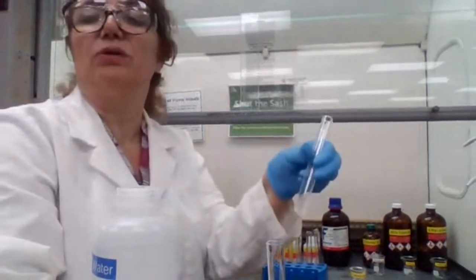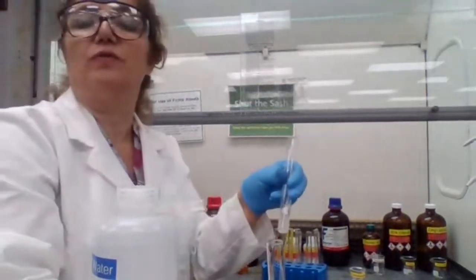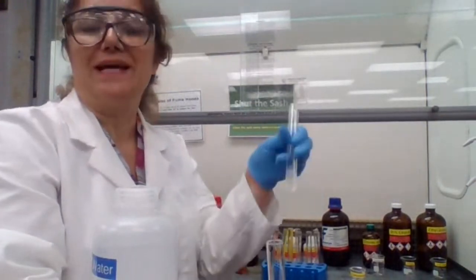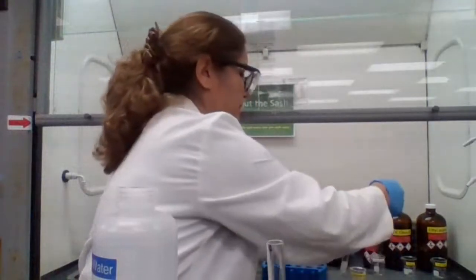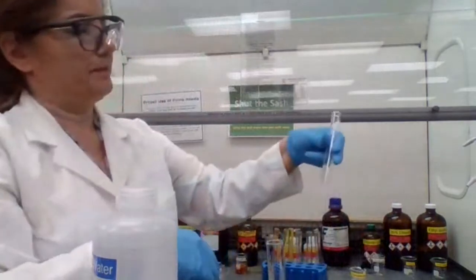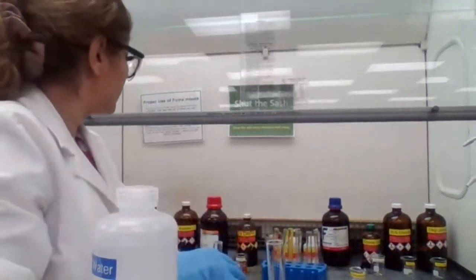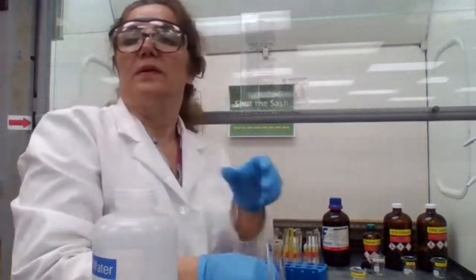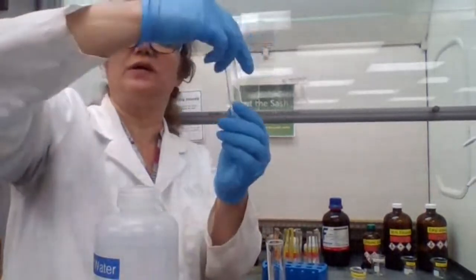We're adding the 1,2-dimethoxyethane to dissolve it, to make sure that it's dissolved. Okay. And when it's dissolved, what's next? Okay, it's dissolved. It dissolved already. What should I do next?